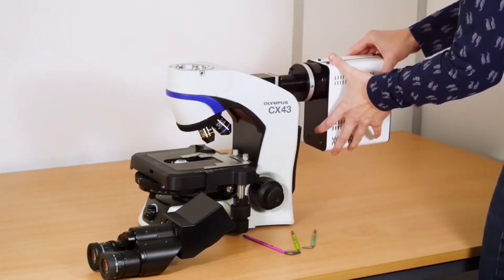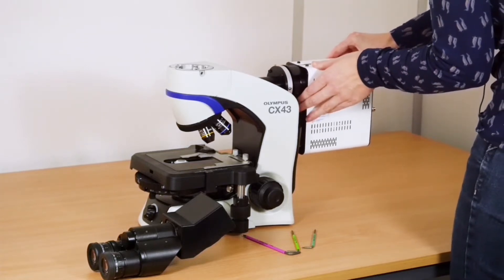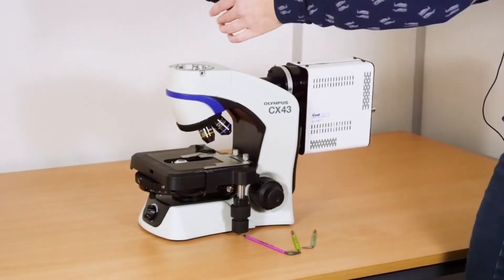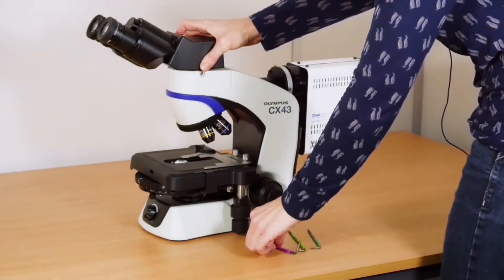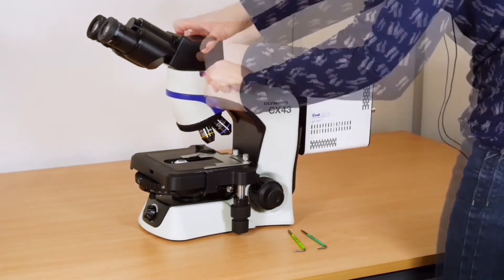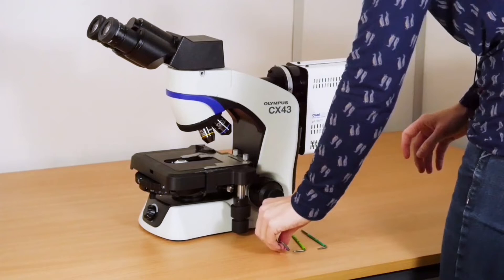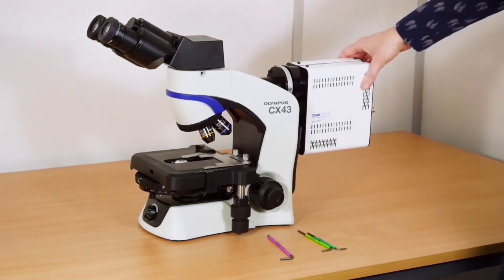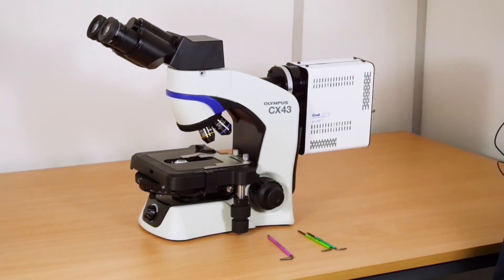Once that is tight and fully secured, reinsert the adapter and place the eyepiece. Once you have connected the power and the control pod, you are ready to go.